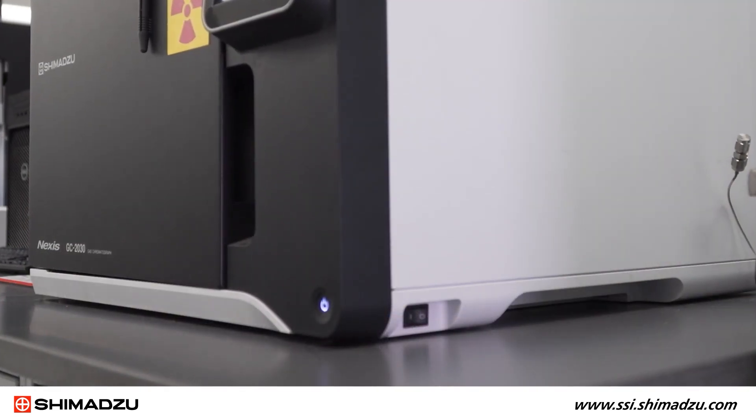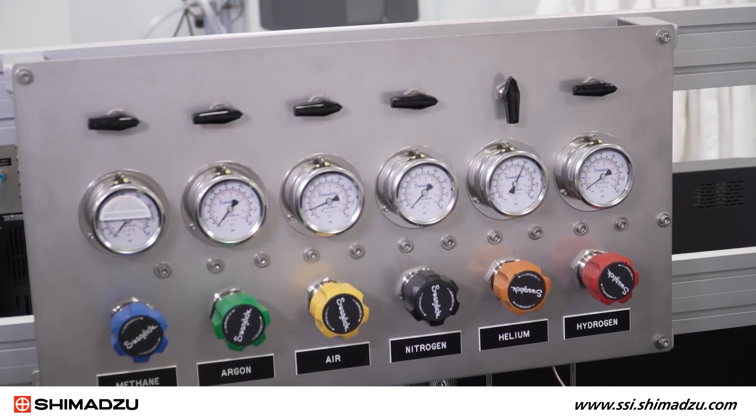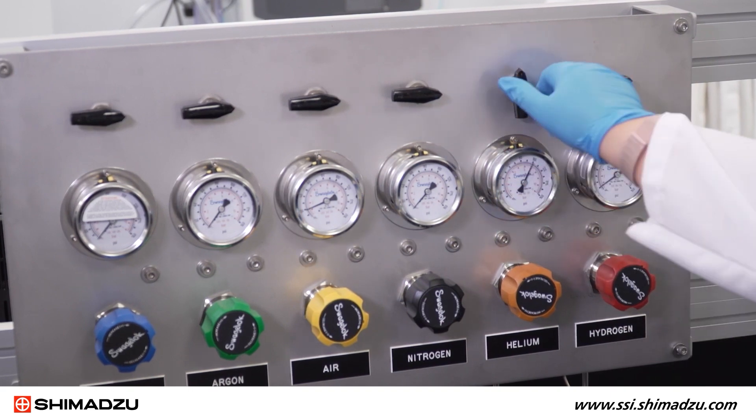Once the system is completely cooled, the GC power may be turned off. The electronic gas flow controllers will stop when the GC is powered off. However, you will need to turn off manual flow controllers yourself.